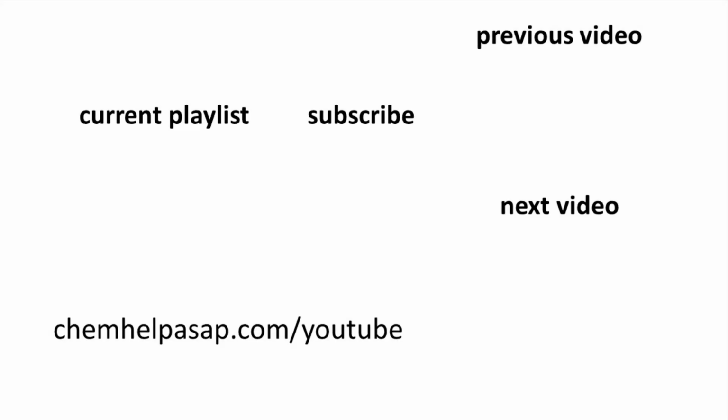I hope you enjoyed this example of the Knoevenagel condensation with salicylaldehyde and ethyl acetoacetate. This transformation and other aldol-type condensations are often simple, high-yielding reactions.